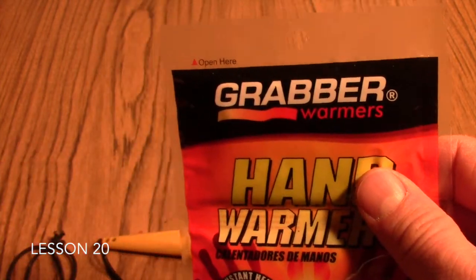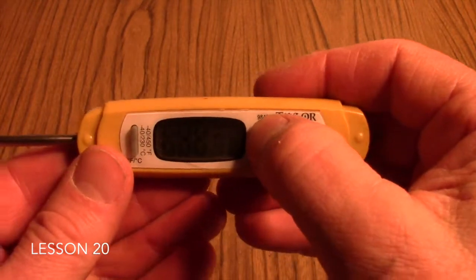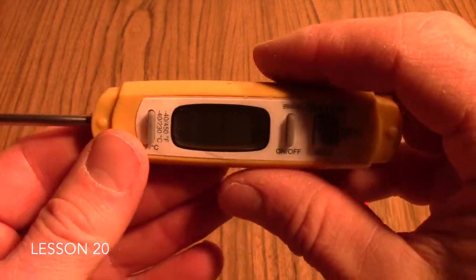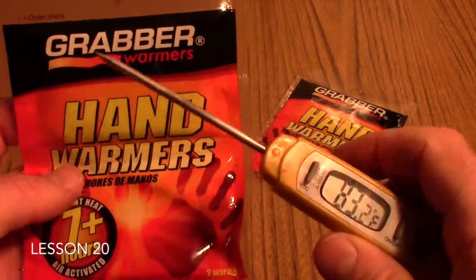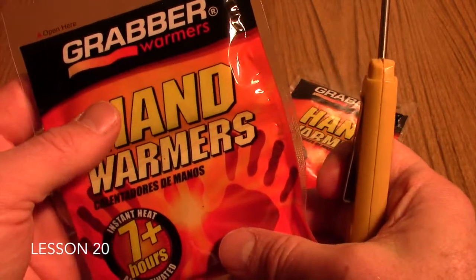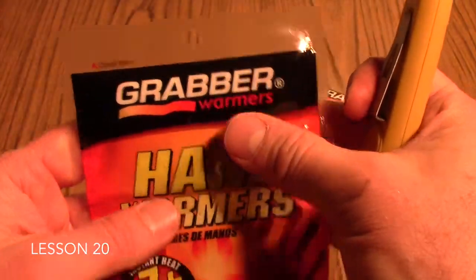Basically what you'll do is take your thermometer and turn it on, and we're just going to pretend here that you would just smash this side of the package into this one.